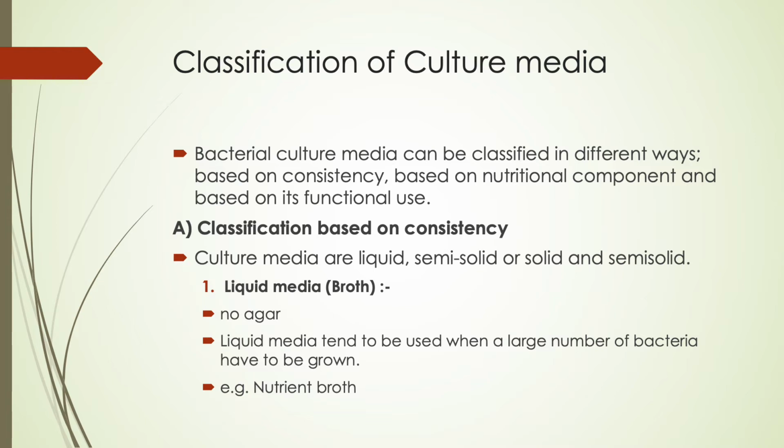Or you say, let's say I want to culture a type of bacteria, and this type of bacteria requires special requirements. For some bacteria it needs, as an example, specific nutrients and specific environments. So at that time you need a specific media for that.